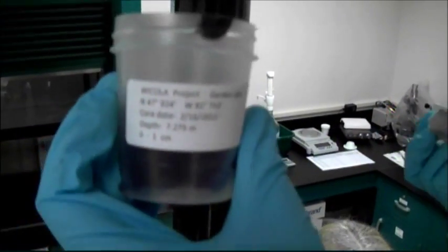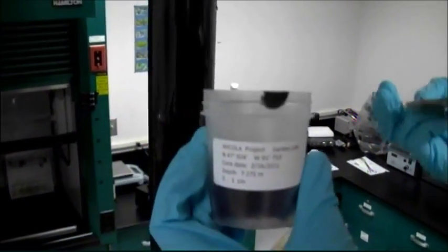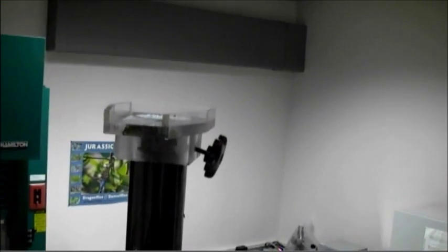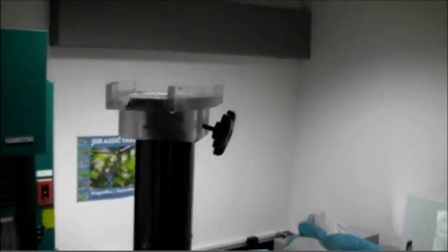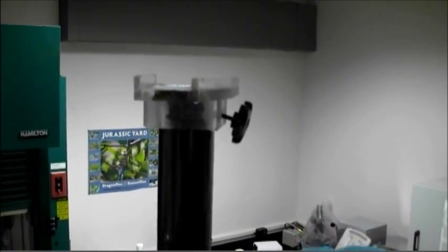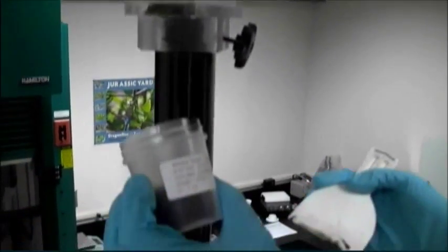And then we gradually extrude this interval by interval until we get all the way to the bottom. And we'll have a separate file for all of these. And then we can start doing our sediment dating and our biological and chemical analyses and all of that stuff.